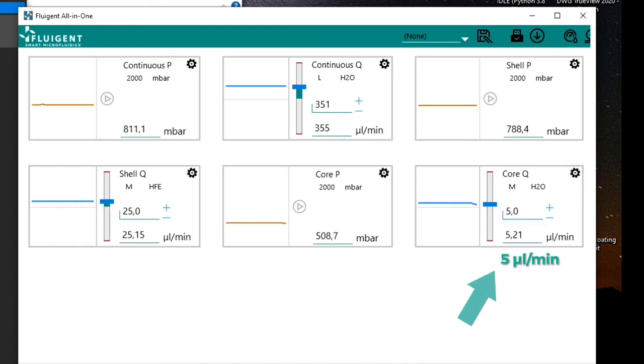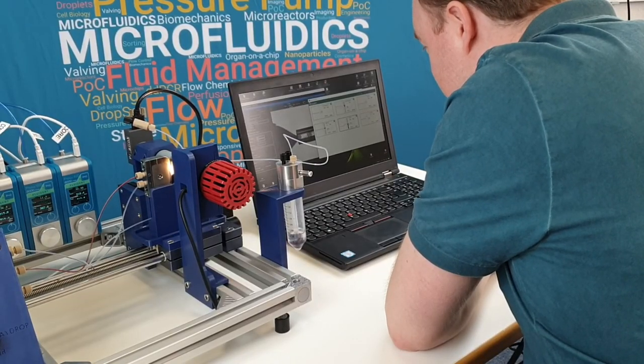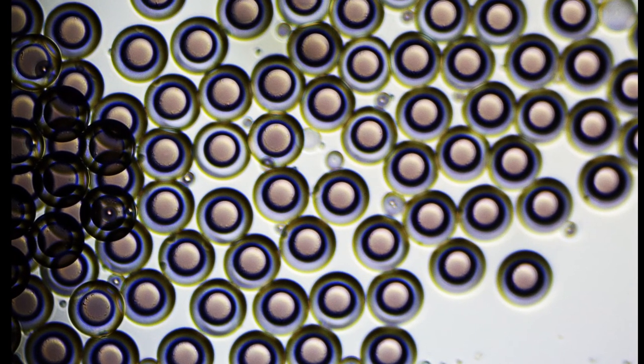You can then reduce the pressure in order to get a flow rate of 5 microliters per minute or slightly less. The double emulsion production begins. The flow rate of the shell phase may be increased to 30 to 35 microliters per minute. Here they are: highly monodisperse, stable double emulsion droplets.